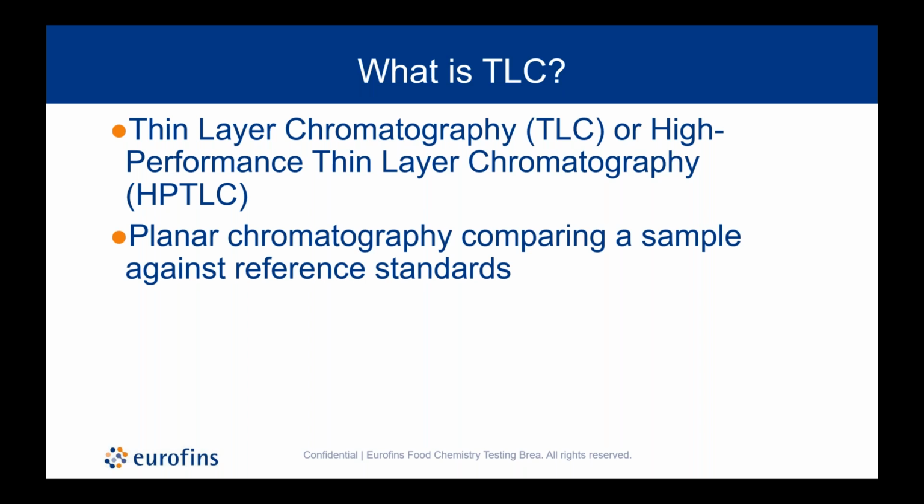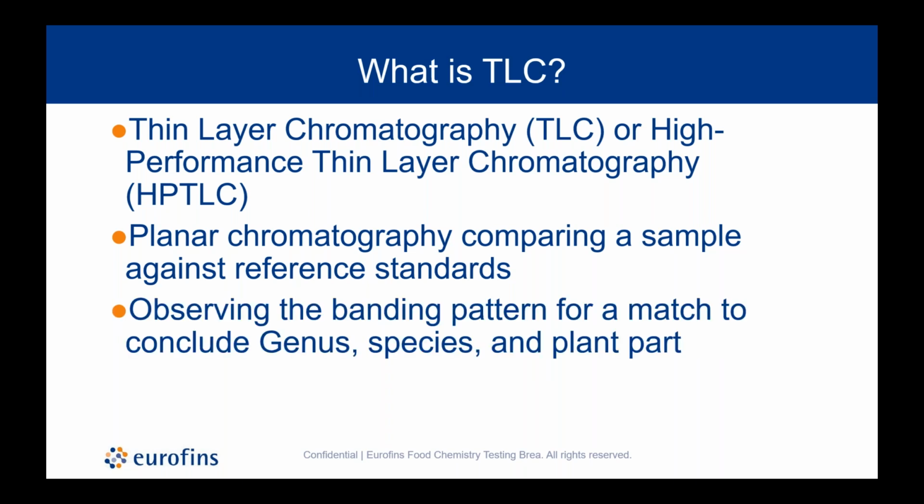The general science behind TLC is that it's planar chromatography, and with botanical identification, you're comparing a sample against reference standards, and using the comparison, observing the banding pattern between your sample and your standards, and using your method, you're going to conclude to the genus, the species, and plant part, or other types of substances for non-plants.